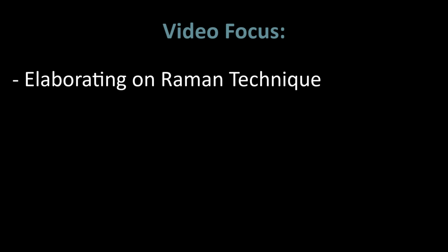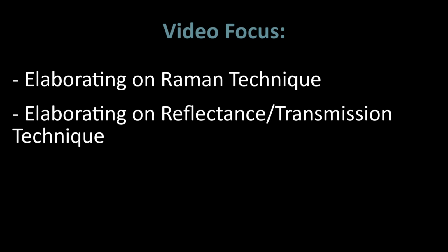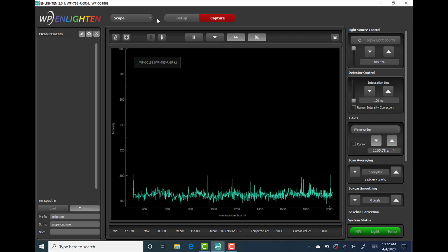This video will be dedicated to elaborating on Raman technique and reflectance/transmission technique, and what steps need to be taken so that each respective measurement can be collected appropriately. If the user desires to collect Raman measurements, a Wasatch Photonics Raman spectrometer is required. For this demo, I am using a Raman spectrometer with a 785 nanometer embedded laser. As a reminder, Raman technique is utilized to capture scattered light from a sample or analyte when a monochromatic light source is used for illumination.